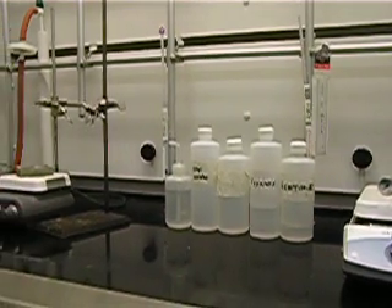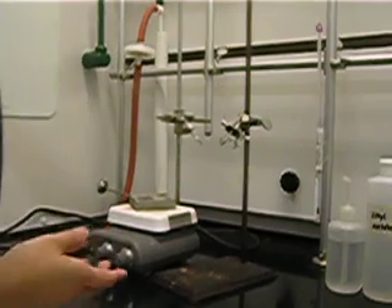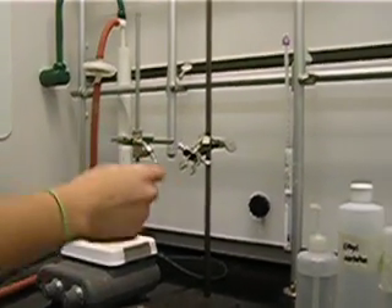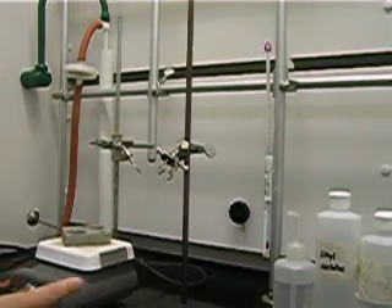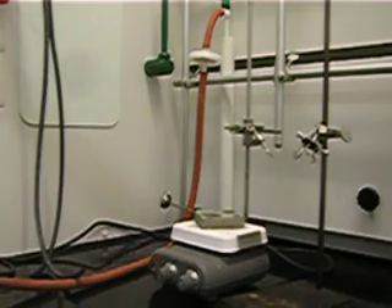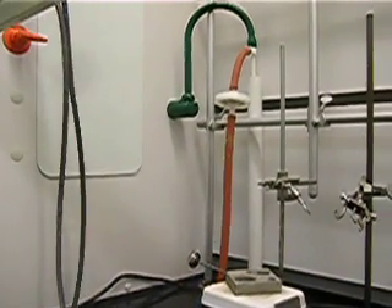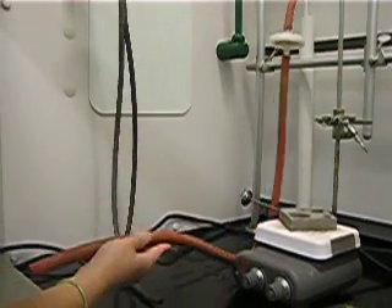You will have two stands — one will have a hot plate and one without one. You'll have your clamps also. In the back is your thermometer. Over here you will have your red tubing, which will always be connected to the aspirator, and you will be using this to apply vacuum.